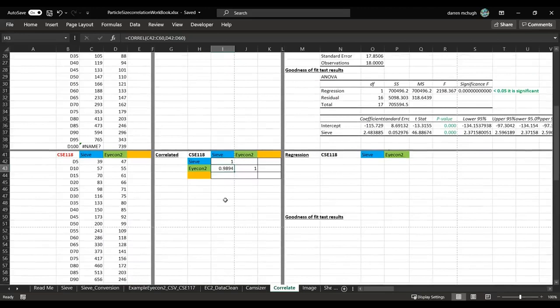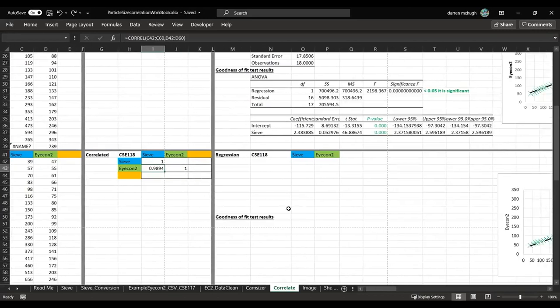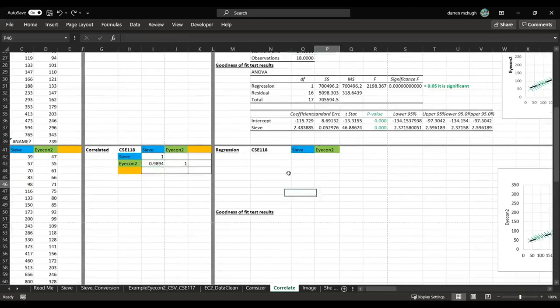As mentioned, if this number was coming out, let's say maybe negative, or if you had a couple of, let's say, crazy outliers, for example, I will just simulate that. These values will drop down, maybe even if I go further. Let's say we had 1,000 in there. So it's getting less significant with so much variation. Okay. So that's showing that there's a strong relationship independently between Icon and sieve. That's a great first step. So I think it makes sense now to move on to looking at the regression analysis, and I'll just show how you do that with Excel.